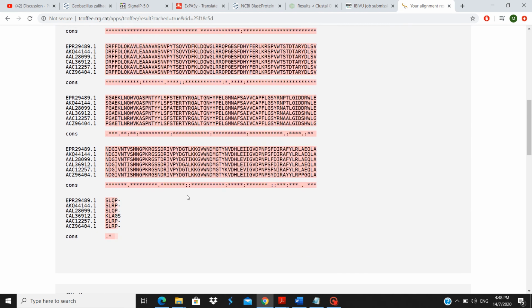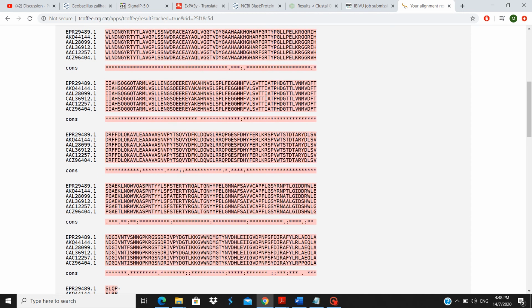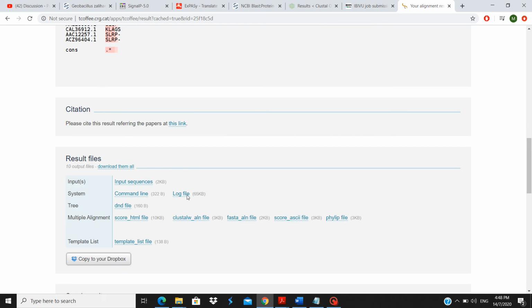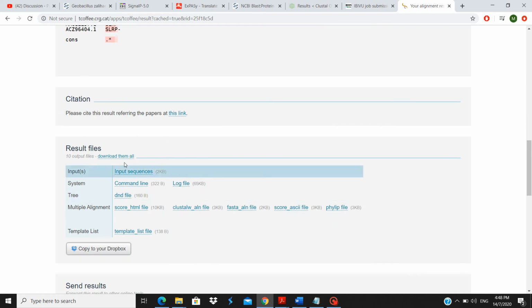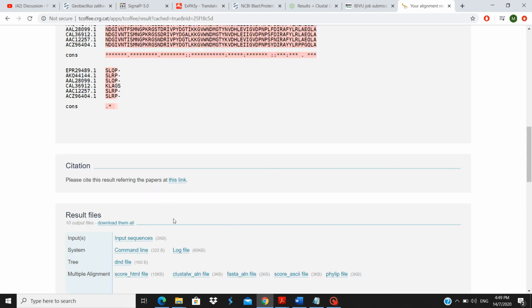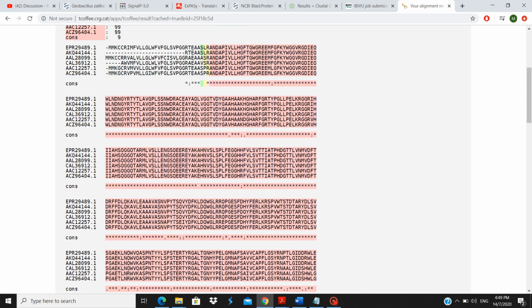It is for our 3 pairs and 6 sequences that I collected from 5.1. And here you can download all the results that you get. So this is the result, and at this point we came to 5.4.